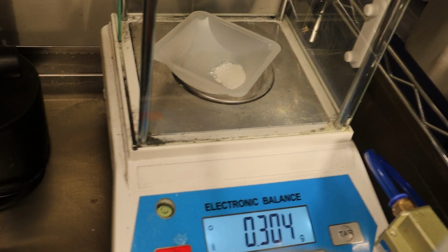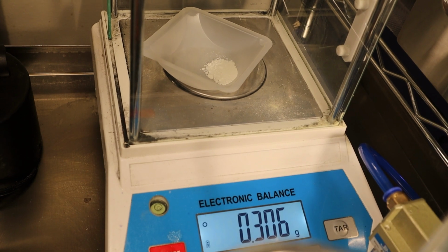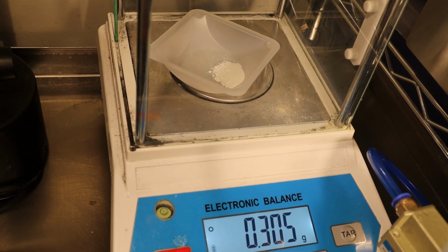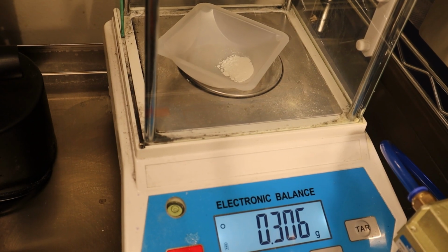Also, I found out there was more at the bottom of the centrifuge tube when I was throwing it away, and I put that on the scale. So I actually have 0.306 grams, which is more than the people who wrote the industrial method had gotten. Over 3 times as much per mil. So something isn't right, I'm thinking.